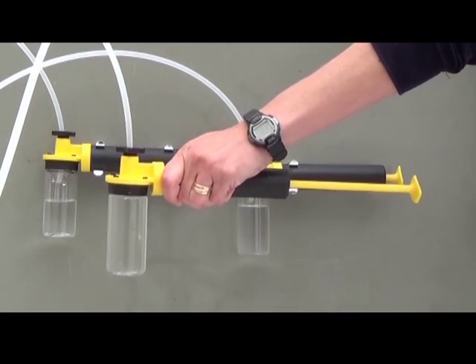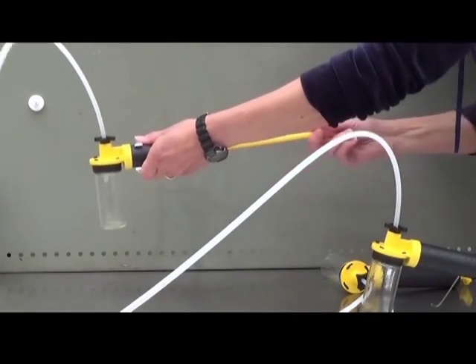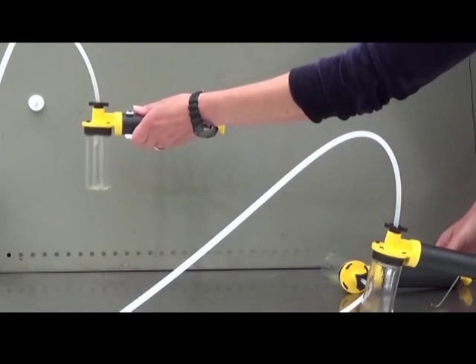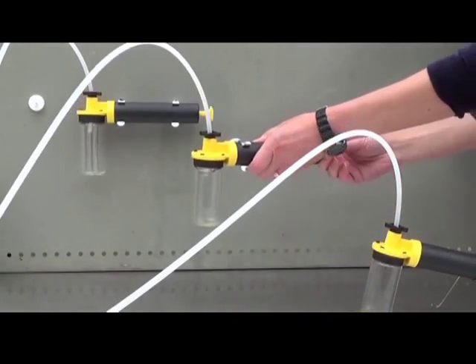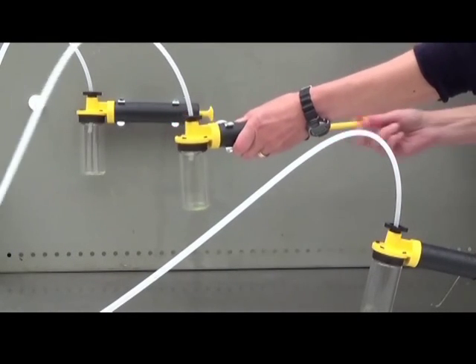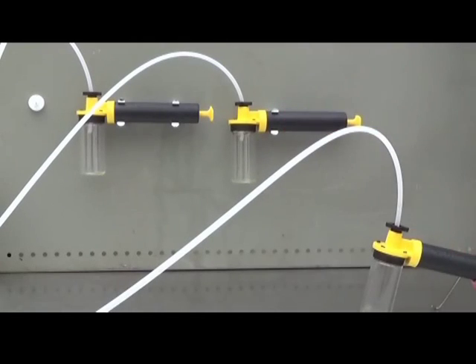Now observe this sampling of ordinary oil. The first bottle samples an oil with a temperature of minus 18 degrees. The other two are ordinary hydraulic oil at room temperature. The second bottle is pumped with three strokes and the third with only two.